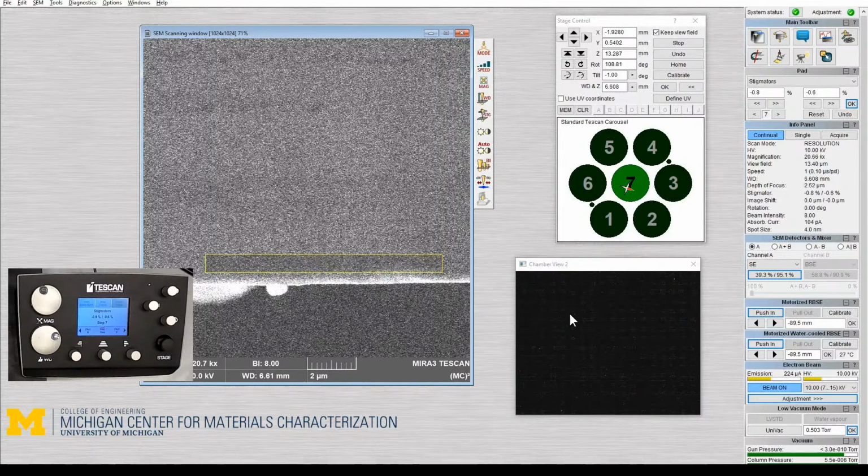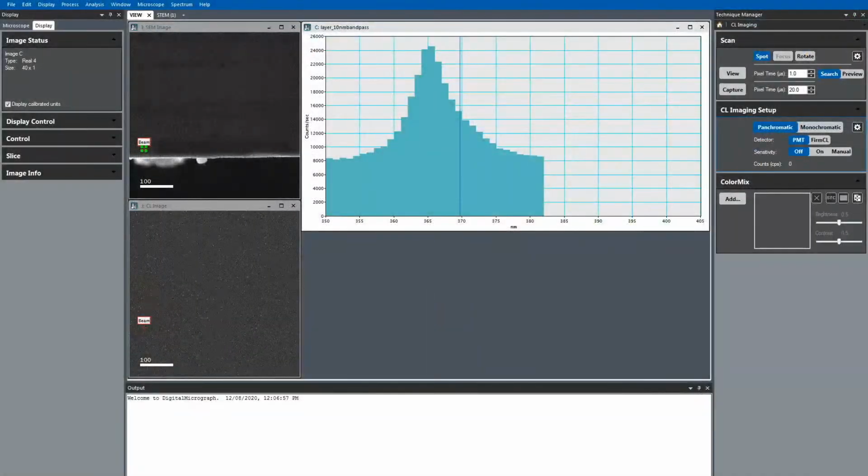So like I mentioned before, the PMT is sensitive to infrared light. Before I turn on the CCD camera, or the IR LED for the CCD camera, I'm actually going to go over and close the shutter. Okay, shutter is now closed. I can turn down the HT. And one thing you'll see to verify you've done it correctly, is that our counts go to 0.